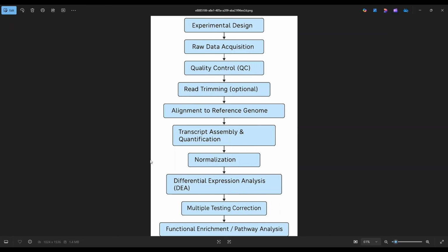So this is actually the first primary information about the gene expression data, that the count of each gene is reported, right? And that can be done by multiple tools like featureCounts and so on and so forth.